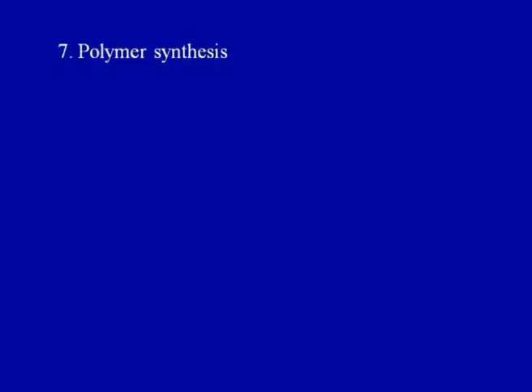Many times in polymer synthesis it can be utilized to measure the size and the polydispersity of a synthesized polymer. That is the ability to find the distribution of the size of the polymer molecules, and if standards of known size are run previously, then a calibration curve can be created to determine the size of polymer molecules of interest in the solvent. So, these are different applications of the gel filtration chromatography technique.